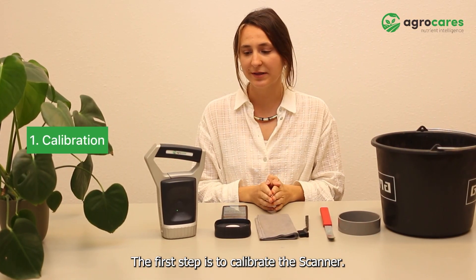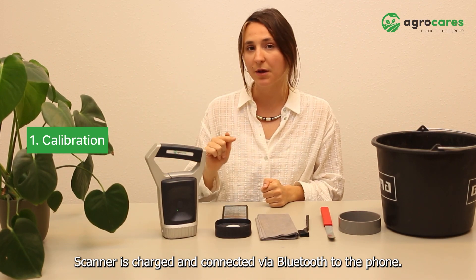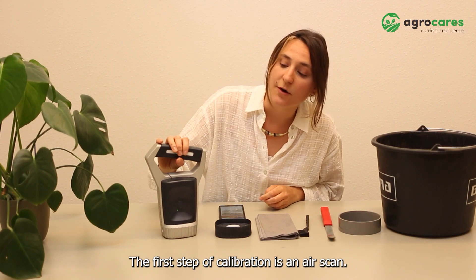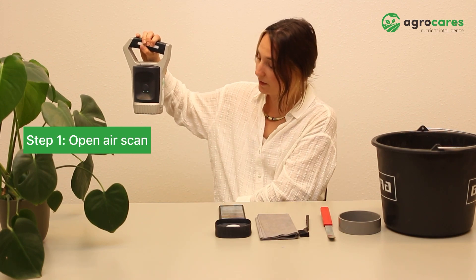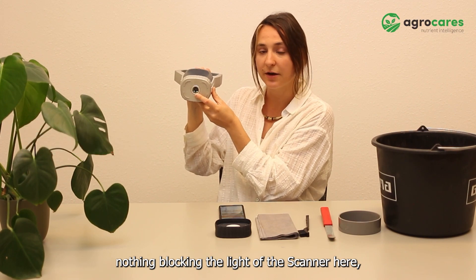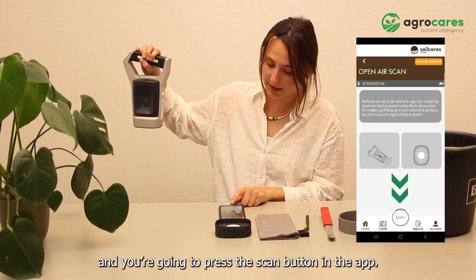The first step is to calibrate the scanner. The first type of calibration is an air scan. You're going to hold the scanner like this up in the air, pointing downwards to the ground. Make sure there's nothing blocking the light of the scanner here. And you're going to press the scan button in the app.